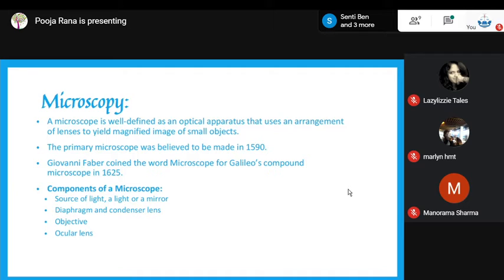So when we talk about photomicrography, we are taking the photo of an already enlarged image. So that would be photomicrography. So over here, we would be using the term photomicrography. We are photographing the minute object whose image was enlarged, and thereafter we are seeing that enlarged image and capturing that particular image. So that would be called photomicrography. All right. So that's there. Is it clear?